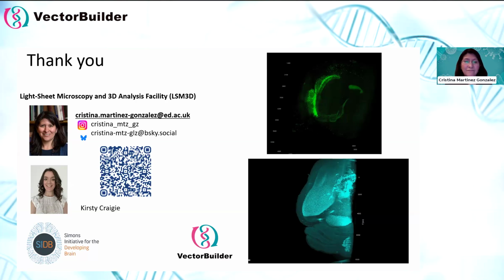If it's cheaper, don't be lazy, guys. Just make it fresh. Although I get it in an emergency, especially for a mouse. EM grade is fine. It will be cost effective, but not wise if you try to produce a larger sample. That is very true.